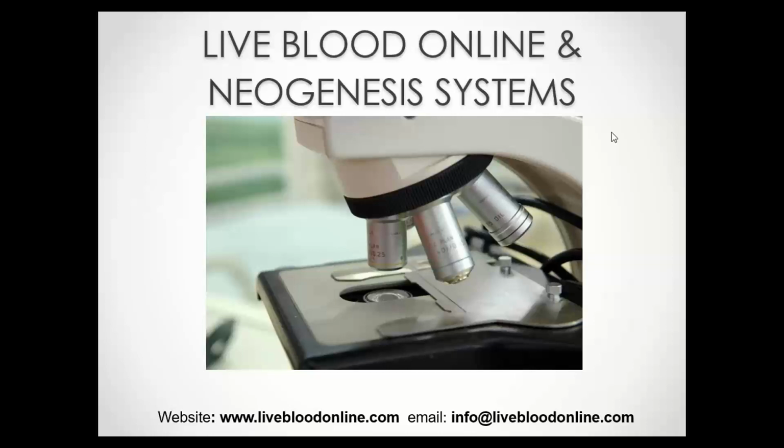So for example, anemia indicators in patients with iron deficiency anemia, liver indicators in patients with liver disease, and so on. Now, live blood analysis was shown to be very accurate in these cases. In one study, the authors were able to demonstrate an equal sensitivity between dark field microscopy and standard chemistry analysis for the variables that were studied. A number of other studies and conference papers have shown a positive correlation between pathology markers and dark field microscopy.